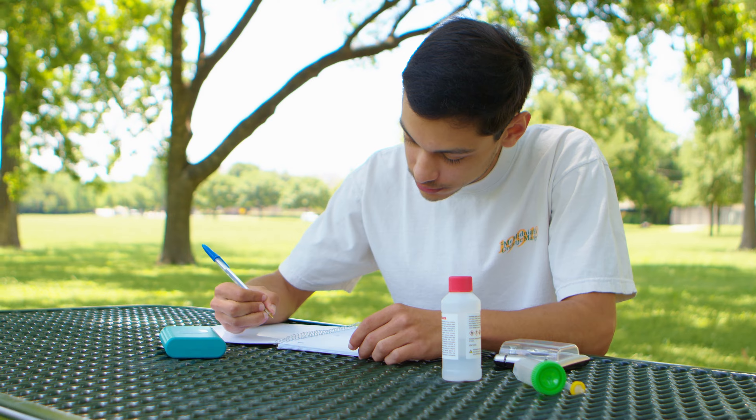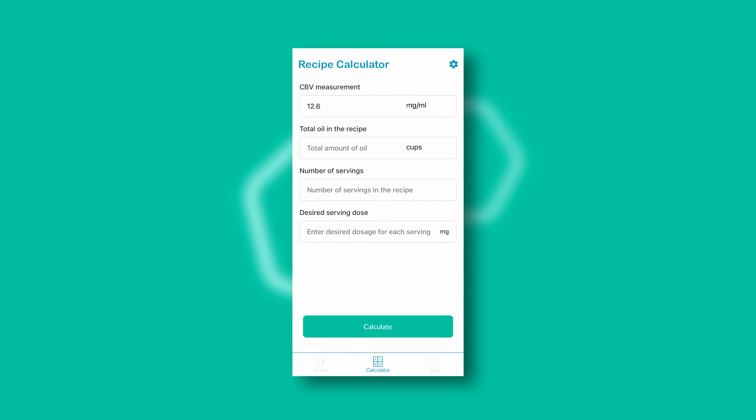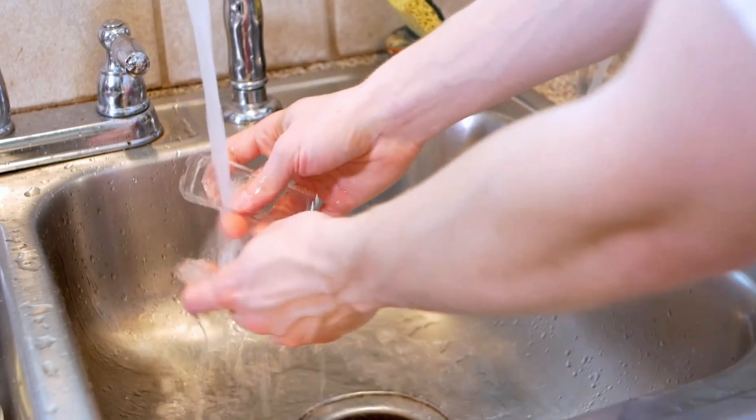Use the app-based calculator to determine how much of your infusion to use in your baked good. Rinse the reusable tray with soap and water and run another test. T-Check. Potency perfected.